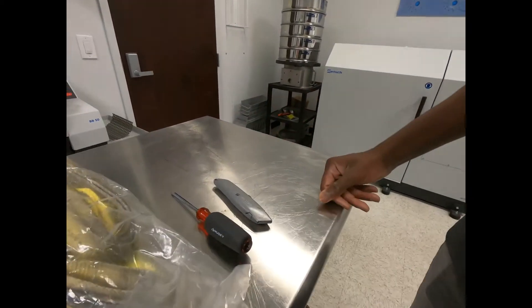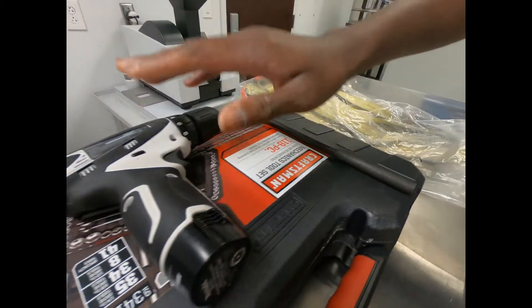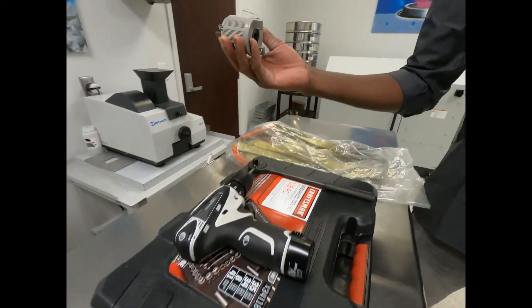A simple box cutter, screwdriver, some lifting straps, socket wrench, power drill, and a plug of your choice.